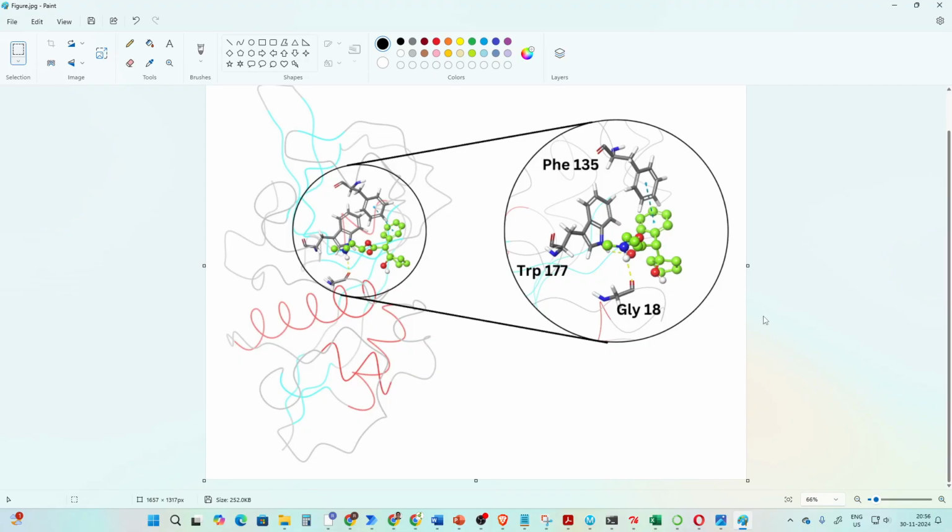And it should have high binding affinity. Those I have to check. If your target is different, then obviously your objective will be different. It depends on your target protein and what you want to study. And if you're looking for some natural product, those natural products with high binding affinity and what kind of interaction you are preferring for that particular target, that depends on what you are looking for. Okay, sir.